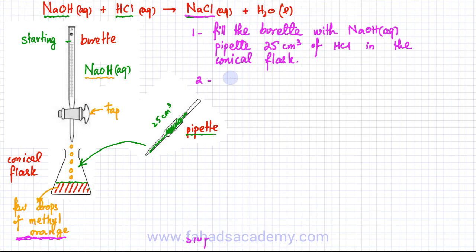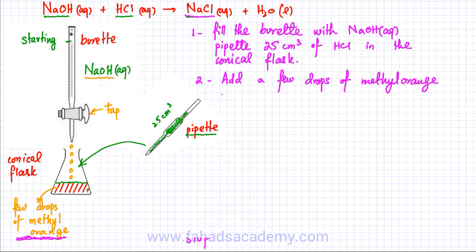So in this particular experiment, I'm adding a few drops of methyl orange indicator to the conical flask.